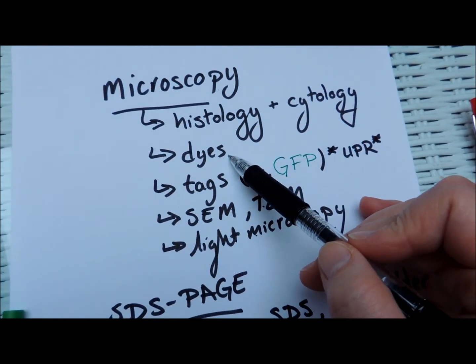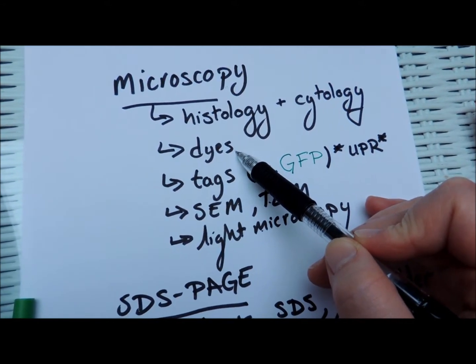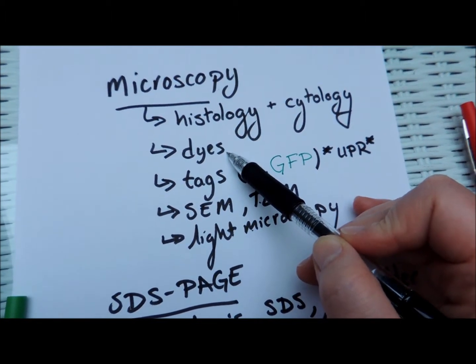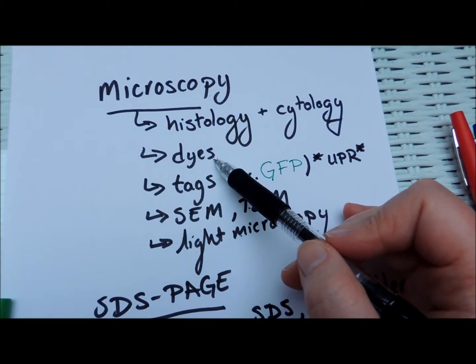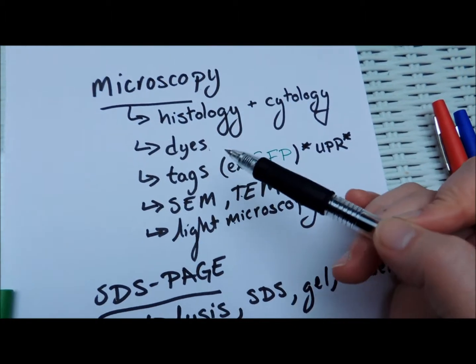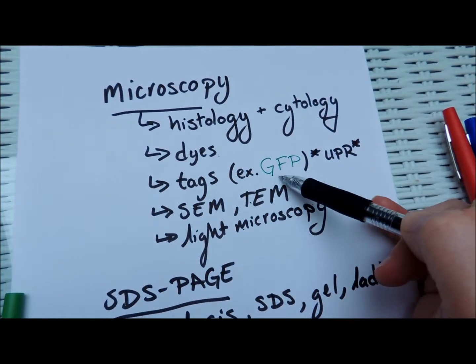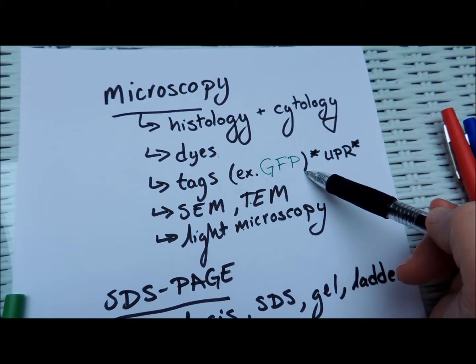We've talked about the need to use dyes in order to obtain a location for particular cellular components. The dye we've used in class is methylene blue, but you've also seen some others in some of our prepared slides. And dyes can attach to pretty much anything. We can find some way to make things colorful. And it's easy for our eyes to observe where particular colors are located, which made the discovery of green fluorescent protein such a big deal, right?